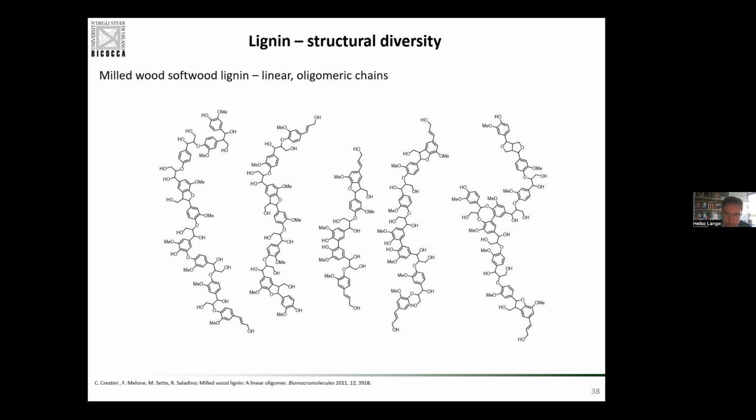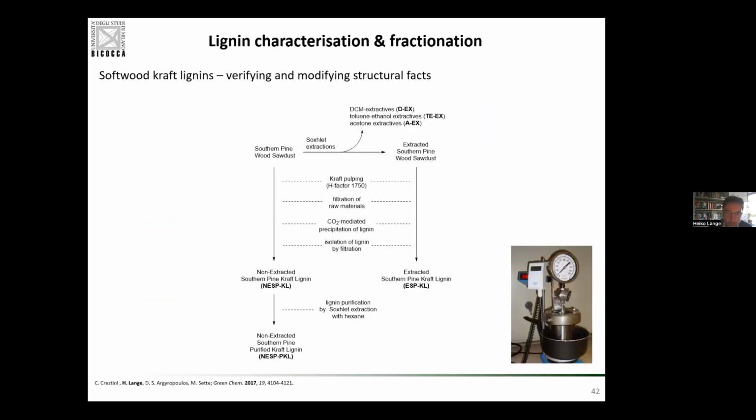And this step in between is a fractionation of my material. Fractionation of my lignin means I go for different types of solubilities of the different polymer in the sense of the polymer size. I can choose systems that select different solubilities of different lignin molecules according to the number of OH groups that are in there, the number of polar groups, the number of acids, etc. So I can play with my chemical knowledge and try to devise a separation scheme, a fractionation scheme, so that I separate different types of oligomeric structures that all together give me the lignin.